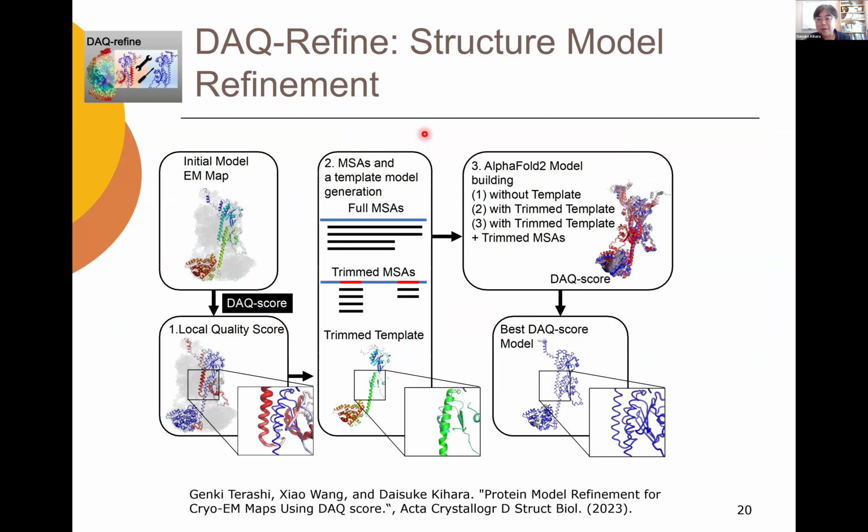If the mistake is small, DAQ refine can fix it. But if the error is everywhere, that's over the scope of DAQ refine. But please try it.